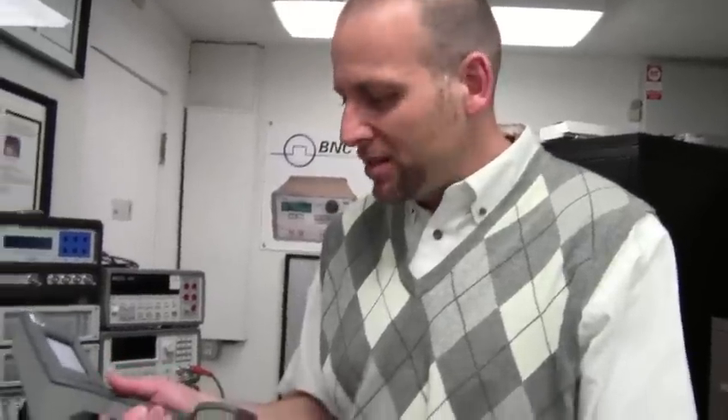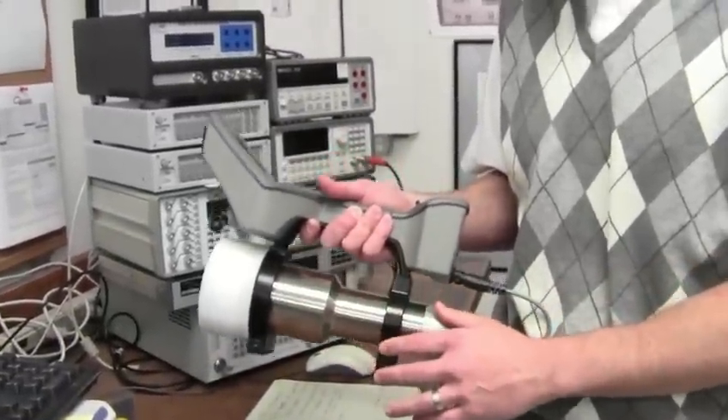The range on this unit is 100 meters, and you would need some access to the local Wi-Fi network to read the data. The antenna is an internal antenna, but it does not interfere with the isotope identification capabilities of the instrument. If you'd like more information, visit our website or give us a call — we'd be happy to talk to you about this feature set. We have a variety of cabling options, detector brackets, housings, shielding, and a lot of nice accessories to make your SAM 940 fit whatever application you have. Thank you for paying attention and let us know how we can help. Goodbye.